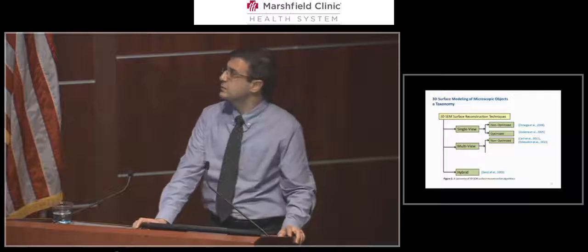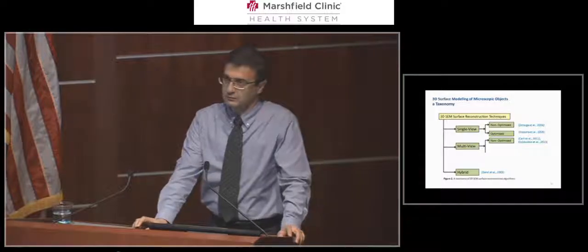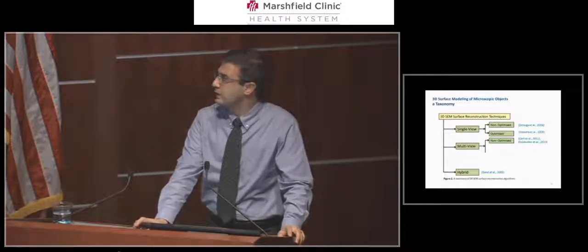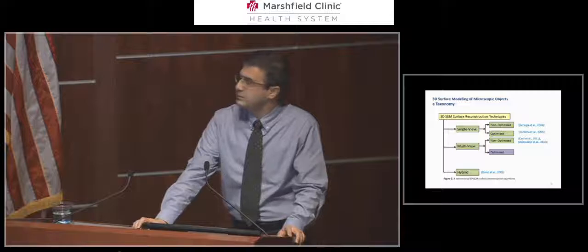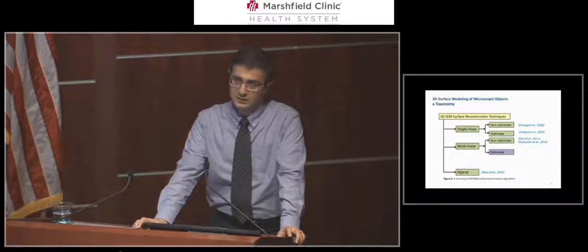In the following slides, I am going to talk about our proposed method. Before that, I want to show you a taxonomy of 3D SEM surface reconstruction algorithms. All green boxes you see here are implemented and developed by previous work in the literature. Our work would be the first to develop an optimized multi-view approach for 3D SEM surface reconstruction.